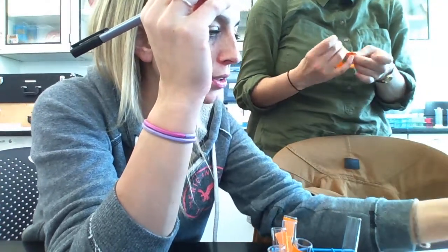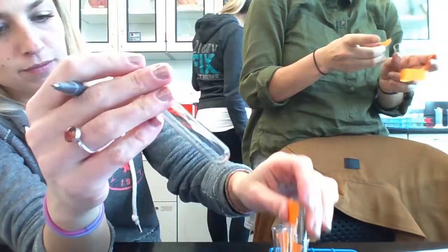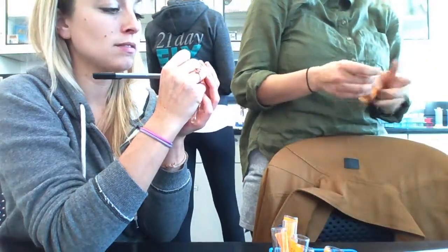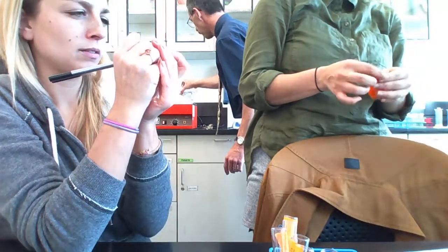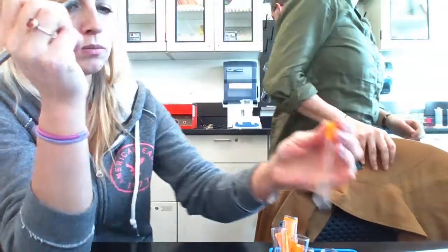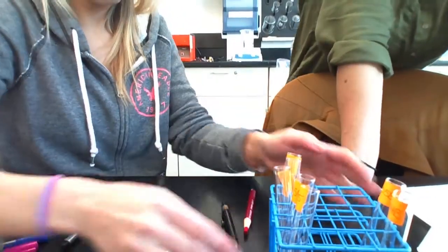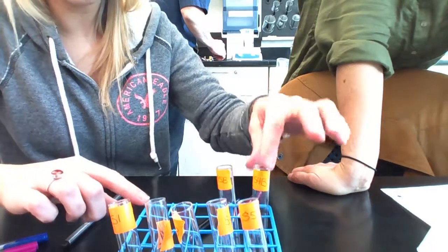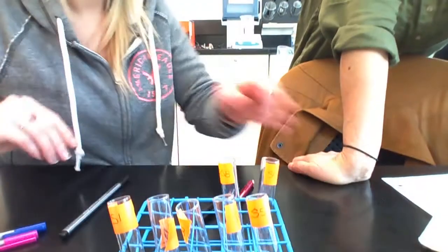So S1, 2, 3, 4, and 5. S4B and S5B. Cool. They want to fall over, so you can also put a clip on. So we just have our tubes here, S1, 2, 3, 4, and 5, and then S4B and S5B. Not quite sure why, but these guys know, so it's alright.